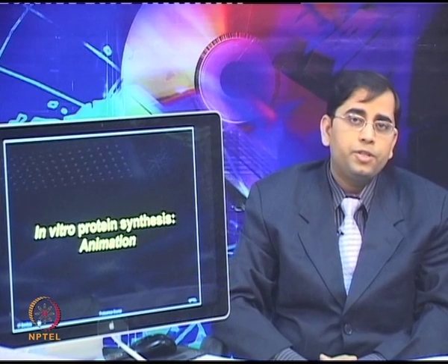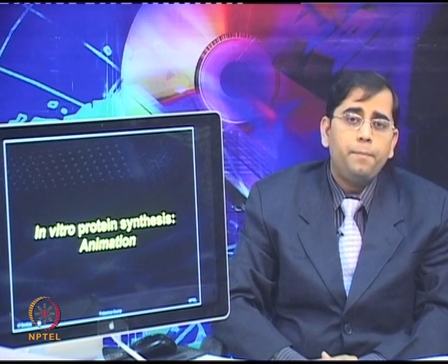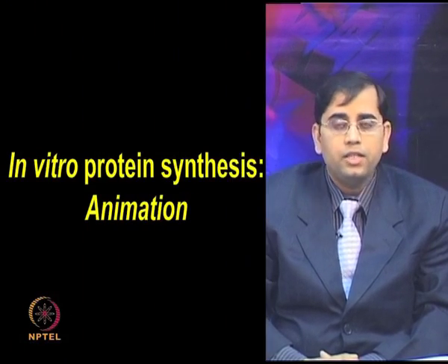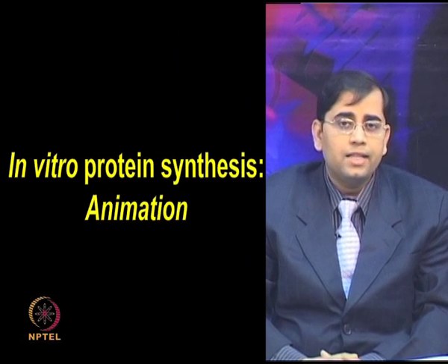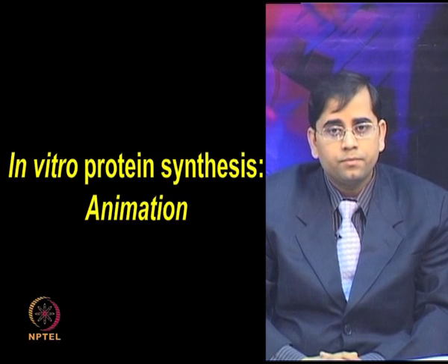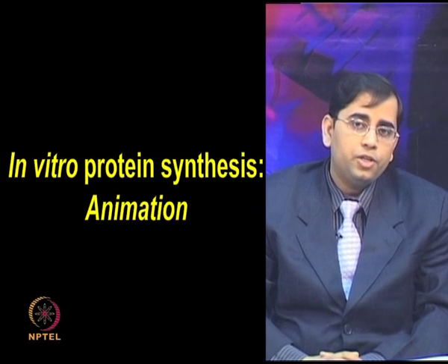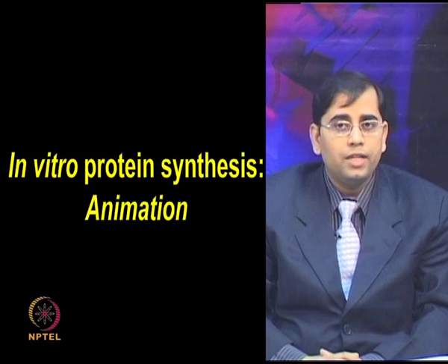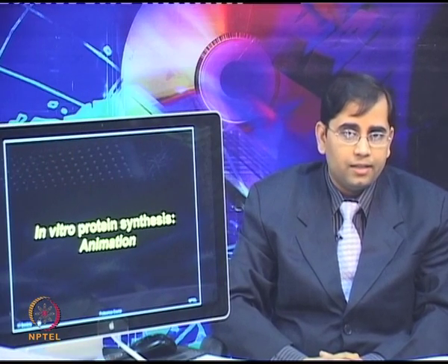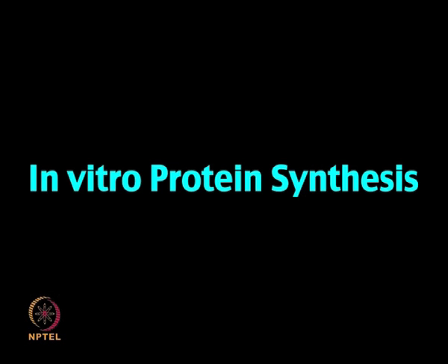The cell-free expression systems allow rapid conversion of genetic information directly to functional proteins. It facilitates synthesis of several proteins in a single reaction. So, let me show you this animation for in vitro protein synthesis, which will explain these concepts very easily. Let us talk about in vitro protein synthesis.